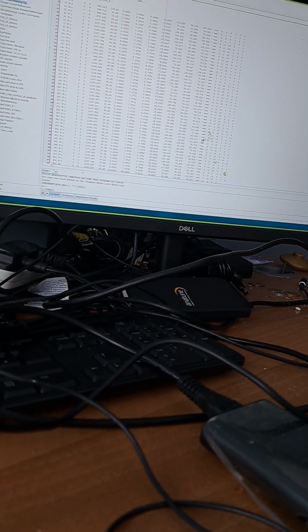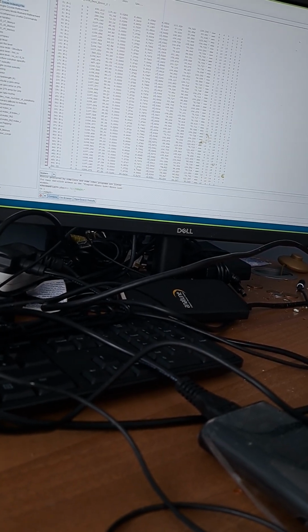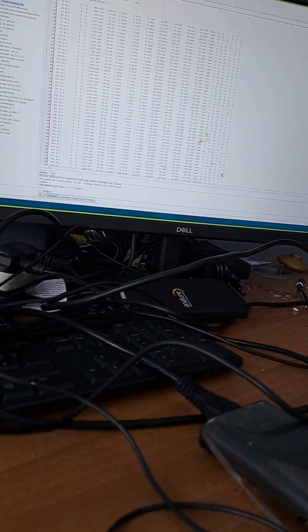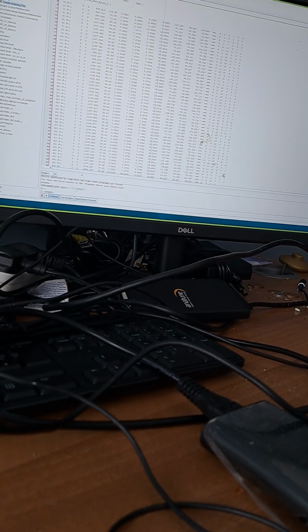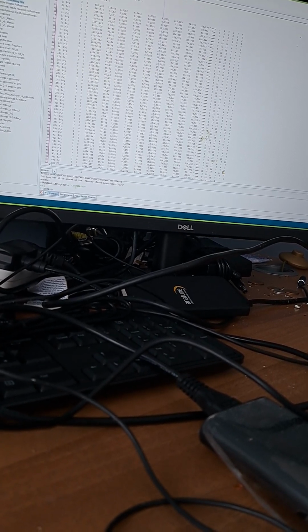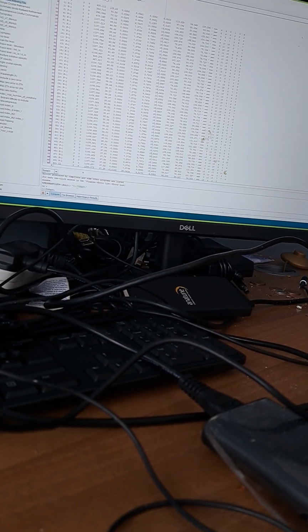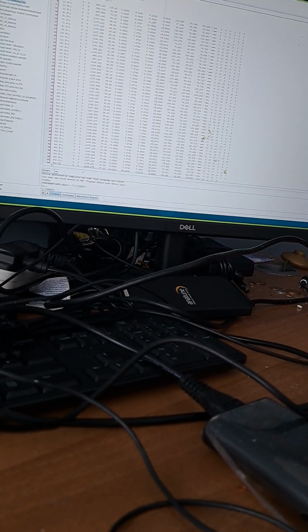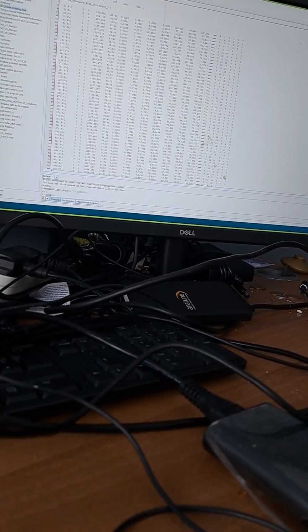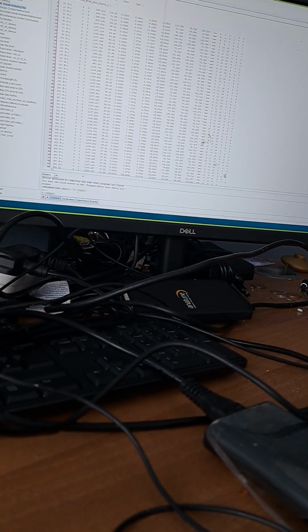It's just that indexing powder samples is really, really challenging. And if you've got a good solution, it may be that I've picked that one peak, or I might be one off here or one off here. Unless you've got really, really good data and it's really well characterized, it can be really challenging. But if you've got a unit cell that is looking pretty promising, I would go with that and try and solve the structure. You can practice indexing.